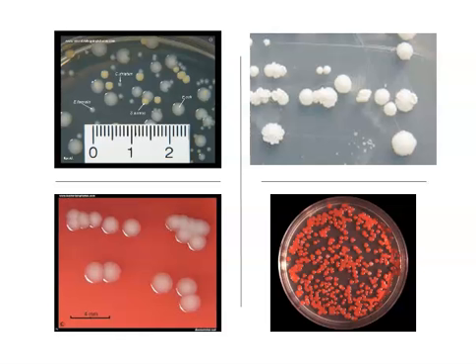Some features of colonies are quite common. We see them in multiple species. For example, the creamy sort of whitish color that you'll see is very common. The smooth edge around a colony, the smooth margin, is quite common. So just like it's very common for human beings to have, say, brown hair or brown eyes, we can see some features of colony morphology that are also very common from species to species to species.